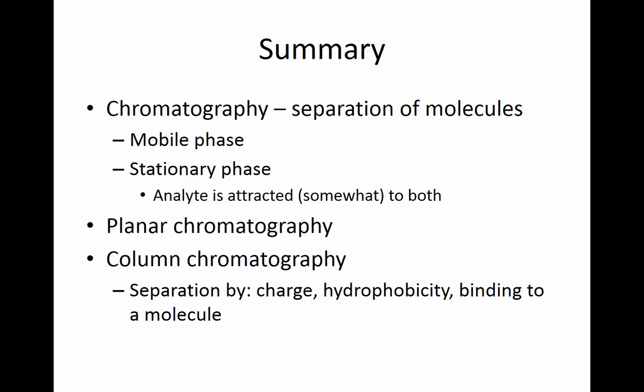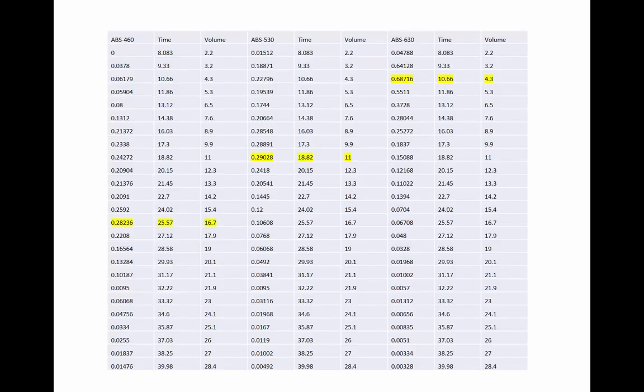And so coordination with this is key here. You need someone to be timing, you need someone to be looking after the volume, and you need someone to be running and doing the absorbances. So it's going to take a concerted team effort to get this lab accomplished properly, and so good luck with that.